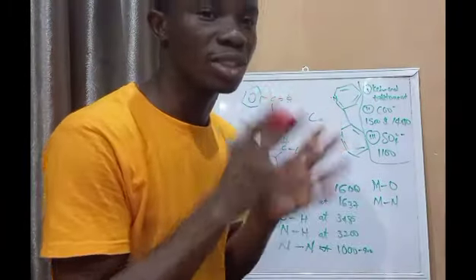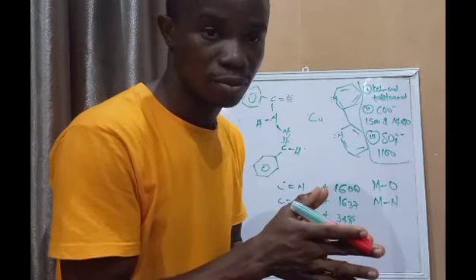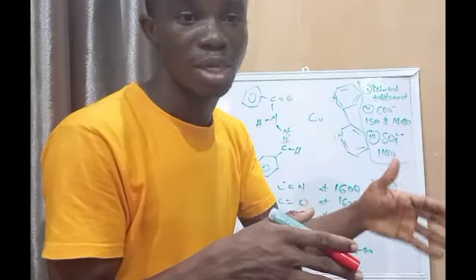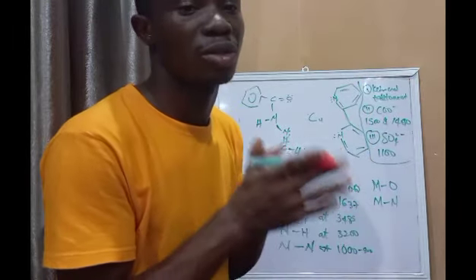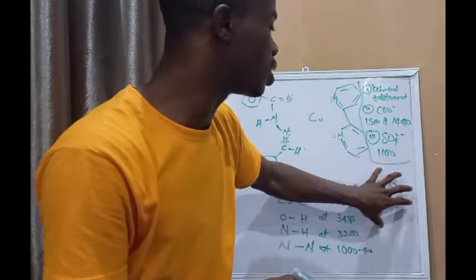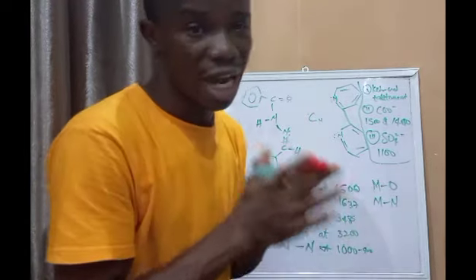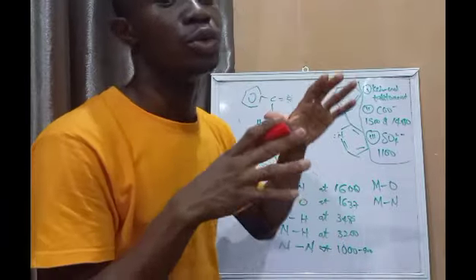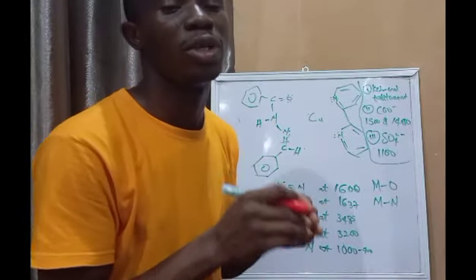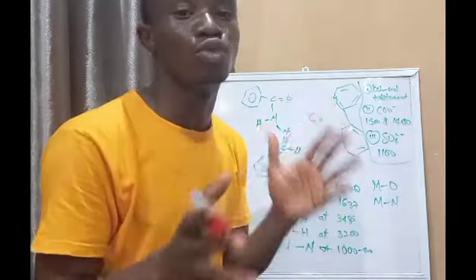So you can always look for signals that are present after coordination but absent in the spectrum before the coordination reaction takes place, in order to get the signal for metal to oxygen and metal to nitrogen. And that is how to use an IR spectrum in the study of metal complexes. So you have to do a comparison.